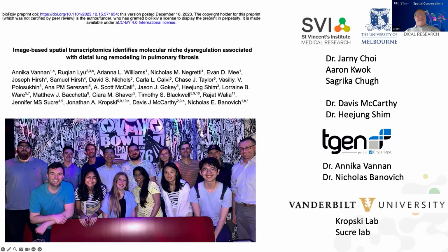Yeah, I have one. I can't get past segmentation. We get asked about it so often. There's been a lot of discussion about transcript density-based approaches to segmentation, things like ProSeg and Ficture. Can I ask what your opinion is of these?